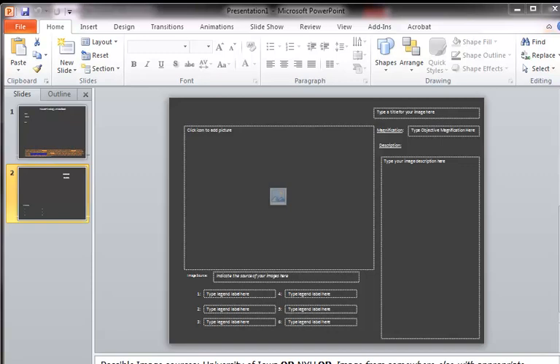If you happen to be using Office 2010, specifically PowerPoint 2010, there's a very quick and very handy way that you can capture an image from the virtual microscope and insert it essentially directly into your e-notebook.